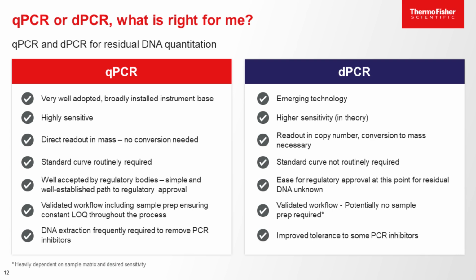From a path to regulatory approval, qPCR is so well known, a well-established path to regulatory approval. I would say on the digital PCR side, there's still some unknowns in this, and our ambition with the assays that we are designing is to really pave that path so that our customers, with our help, have not too many roadblocks when getting their assays towards a regulatory approval.